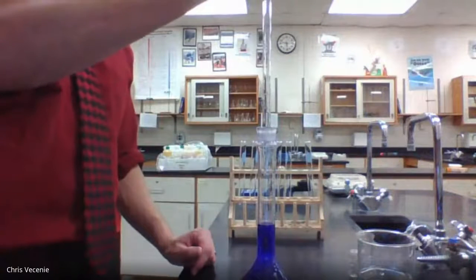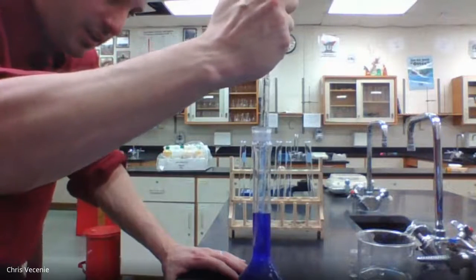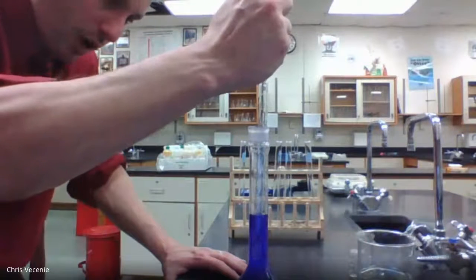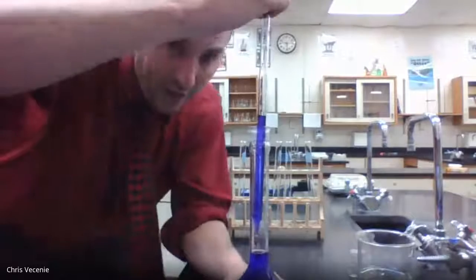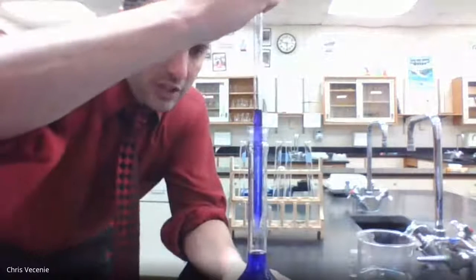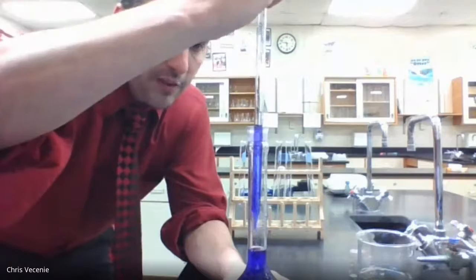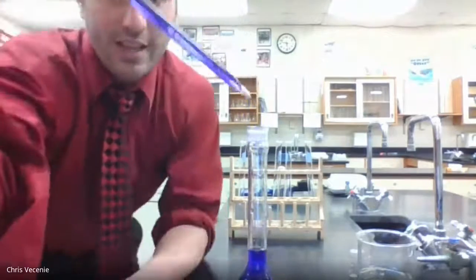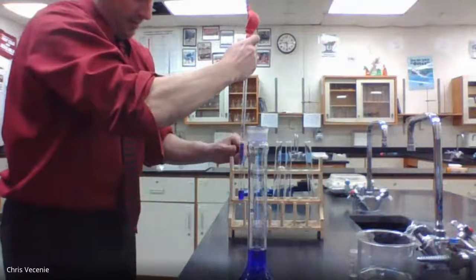So for that first part, I want, and you guys would take a smaller sample of this, right? We wouldn't ever reach directly into the stock. But I'm going to put the tip of that in there, and I'm going to draw up my solution. Now, I overshot there, right? But that's okay. I can just gently expel till I'm at the 5, which I now am. So I'll take that out, and I'm going to transfer the 5 into here.